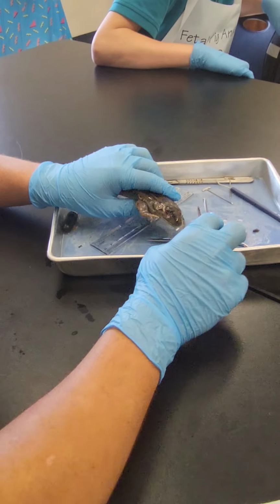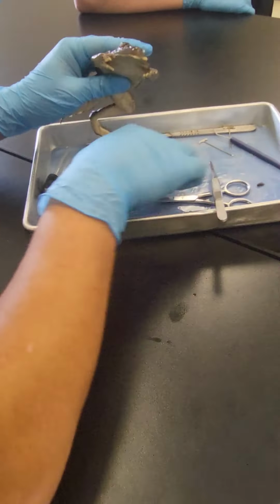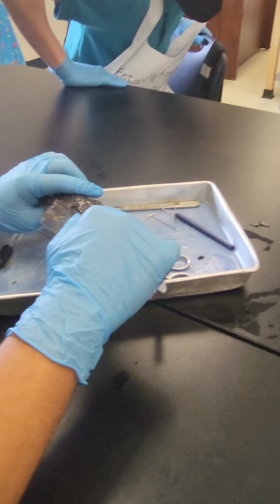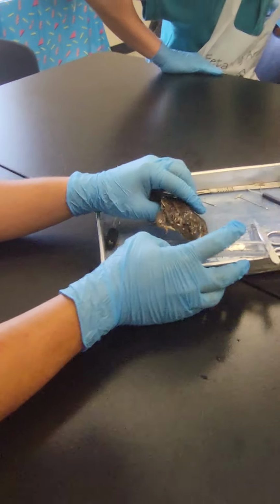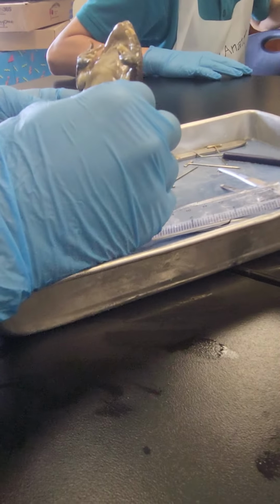Ollie, stop. Stop messing with the eyeball! Measure the diameter. You just broke its skull. Of the membrane. One centimeter. One centimeter? Feel the frog's skin. Is it scaly or slimy? Slimy. Yeah, of course it's slimy.